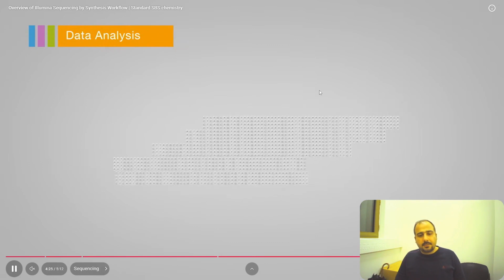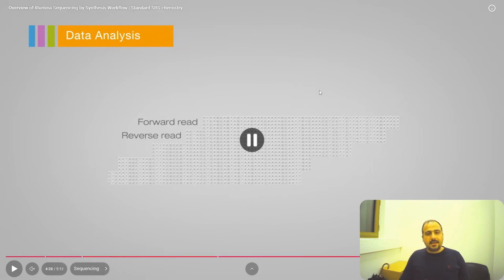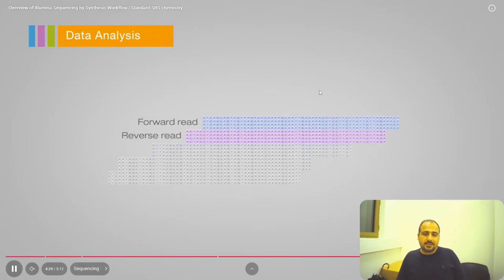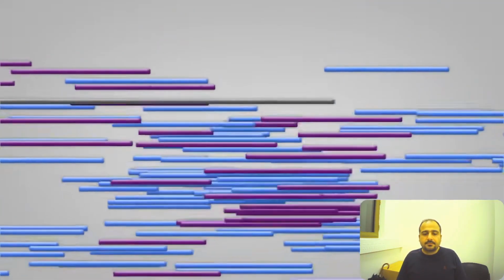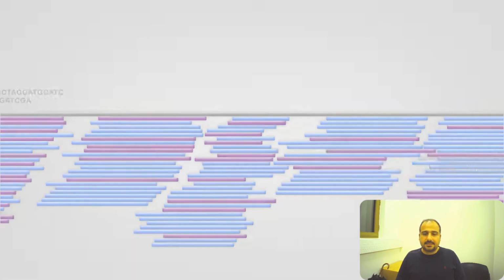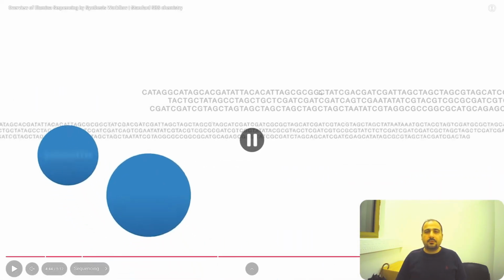But in general, keep in mind that the steps are sample preparation, cluster generation, sequencing, and after sequencing, we have data analysis. This video has truly rendered the steps of sequencing and data analysis significantly much more straightforward for us.